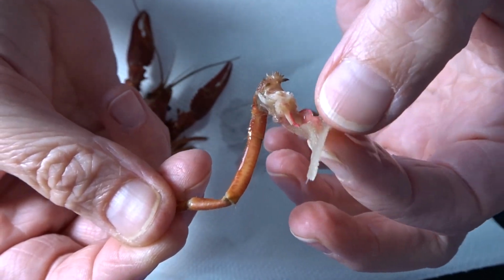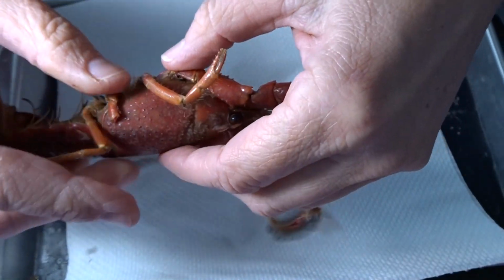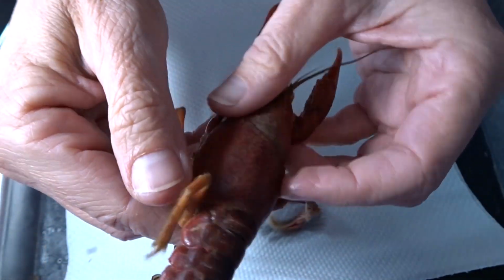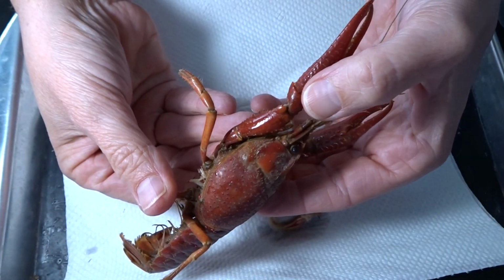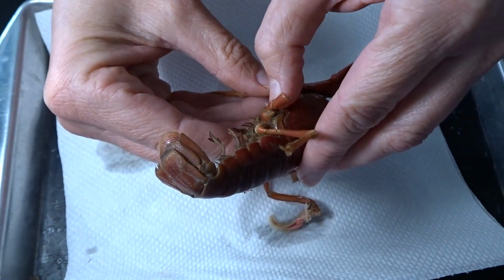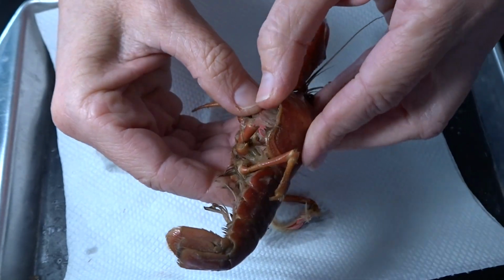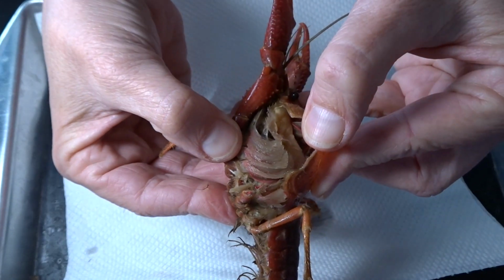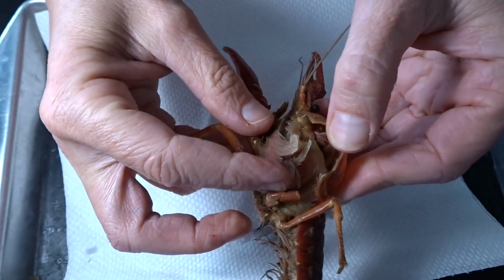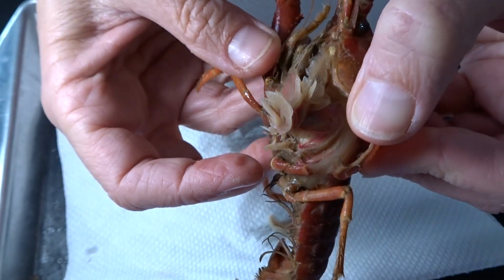Okay, so if we have this feathery thing that's highly vascularized, that has easy access to water, right? That's its gill. So whenever it talked about all the parts of the crayfish, it didn't talk about the gills. And the gills are actually attached, if we were to pull up the carapace, let's see, I'm just going to pick this up very carefully, no cutting. And you can see inside there, look at all those gills. And there are gills attached, right, to every walking leg. So you can see that.